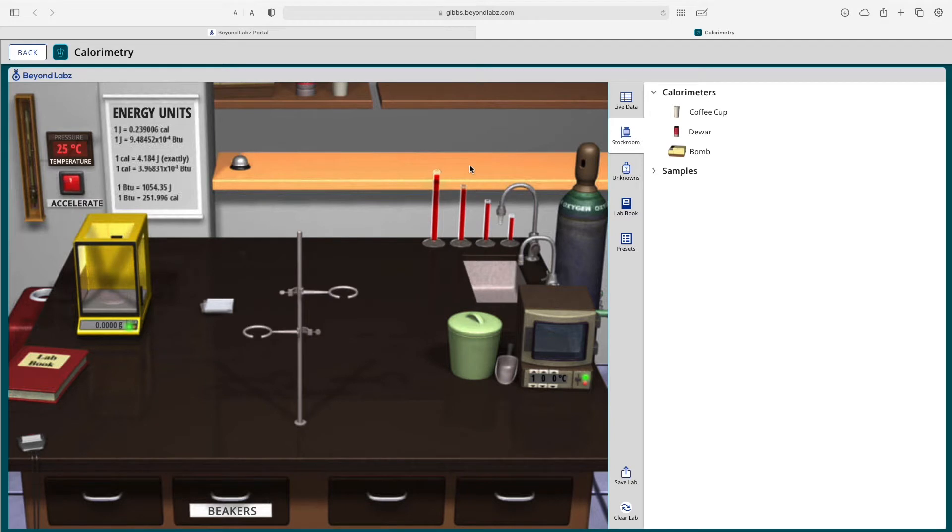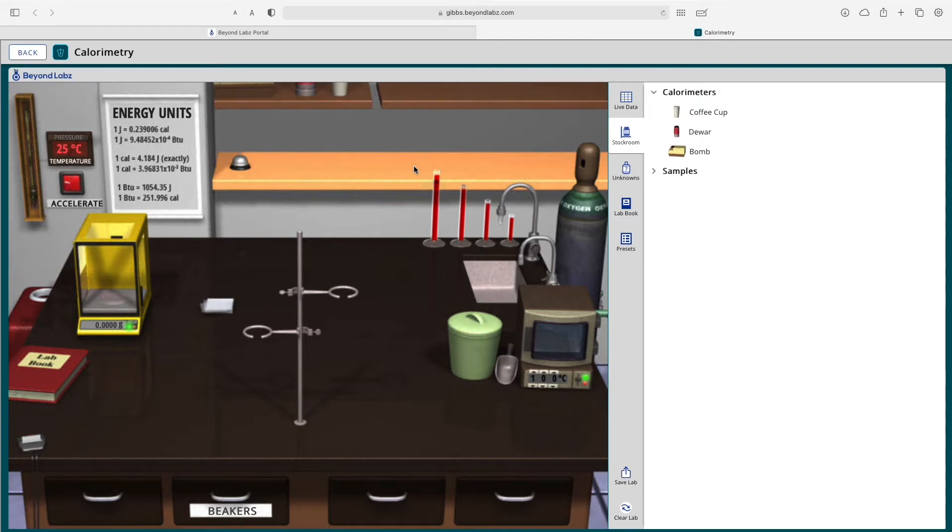Welcome to the introduction of the calorimetry laboratory. This video goes over quickly how to get started in the calorimetry lab as well as some of its features. If you want detailed information, check out our other videos on our Vimeo website.